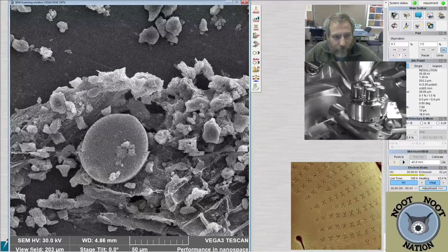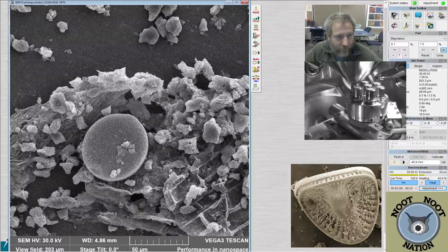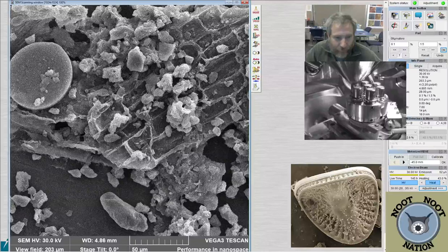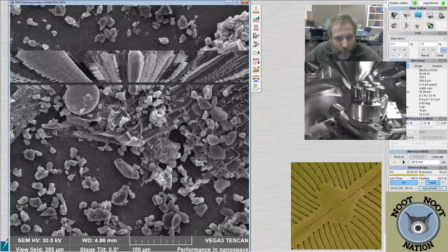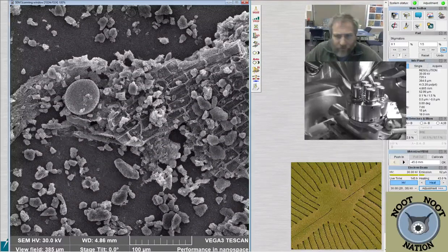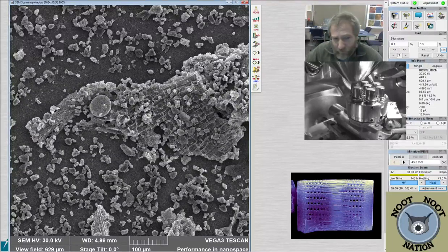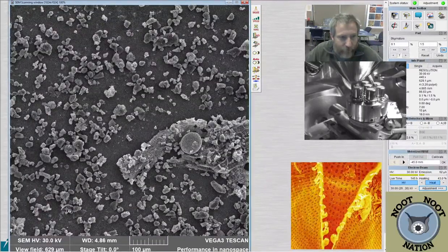If you're wondering what it's sitting on, what all this stuff is, this is actually plant material. You can see right here that each one of these little rectangles is basically a plant cell. So to give you some sense of how big diatoms are, this diatom that we're looking at, I don't remember the actual size, is probably 40 to 50 microns across. So just to give you some sense, here's a little plant cell basically, right?